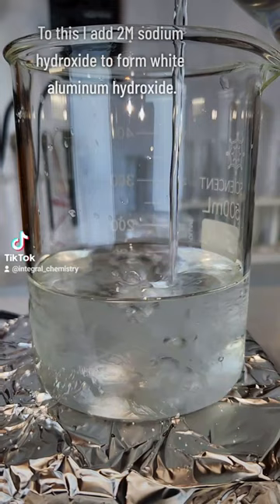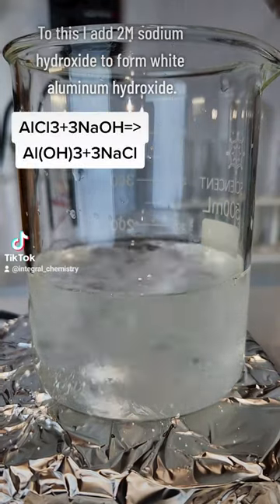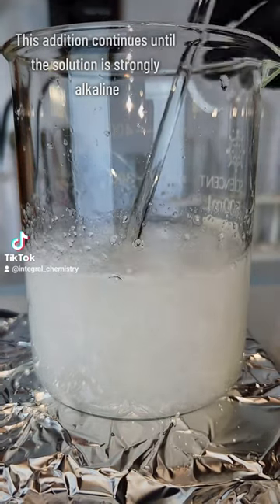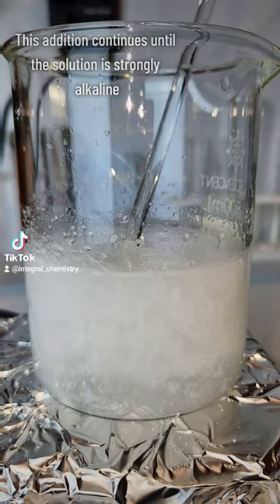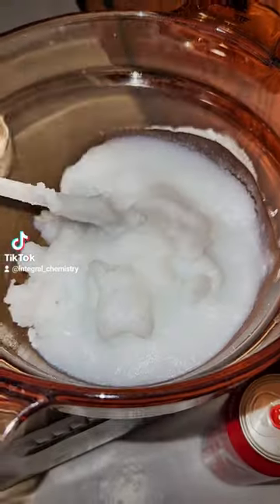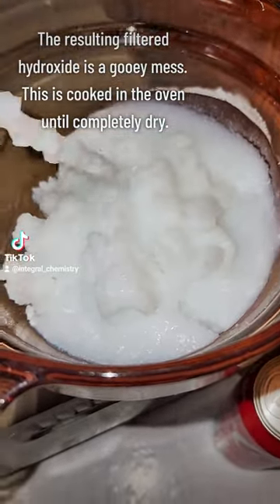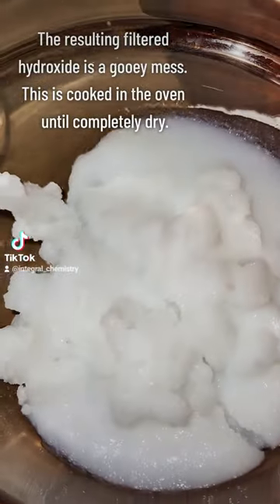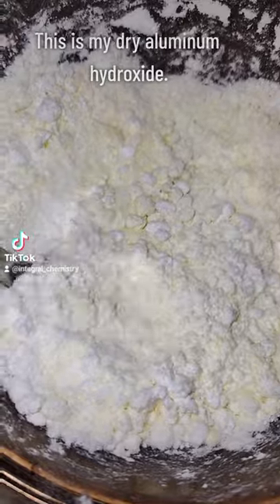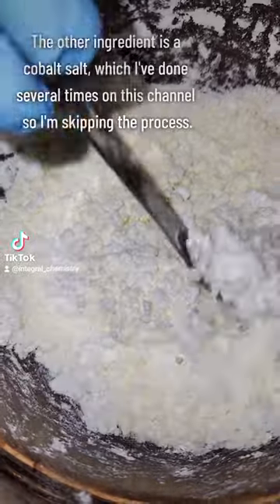I pour some of this into a beaker and then slowly add 2 molar sodium hydroxide to form the white precipitate aluminum hydroxide. This addition is continued until the solution is strongly alkaline as indicated by indicator paper. The precipitate is filtered off, and I'm left with this gooey white mess that's cooked in the oven until it's completely dry. Here's my dry aluminum hydroxide, and this is one of the two reagents I need for my cobalt blue.